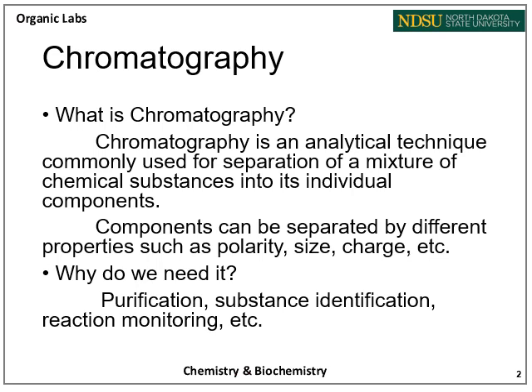Chromatography is an analytical technique commonly used for separation of a mixture of chemical substances into its individual components. Components can be separated by different properties such as their polarity, their different sizes, their different charges, and many other things. Why do we need it? Because it is a very handy tool for purification of mixtures and is often used for substance identification or even reaction monitoring, which are common techniques used in organic chemistry.